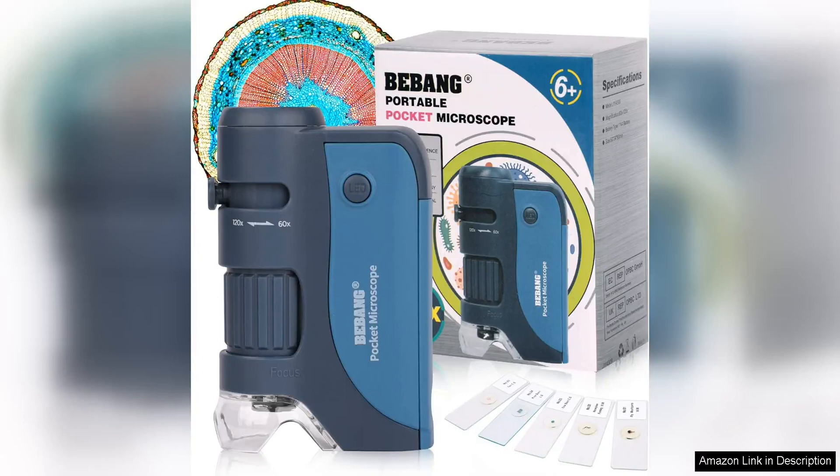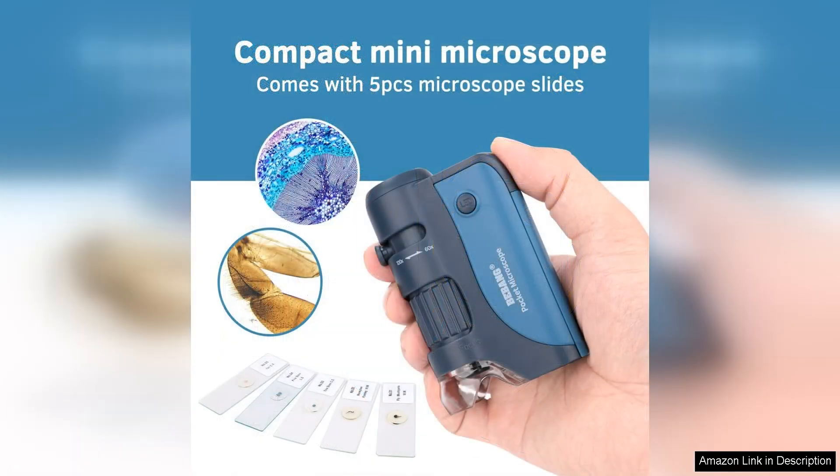The Pocket Microscope is a handy tool for curious kids and adults alike. With magnification levels of 60x and 120x and built-in LED lights, this handheld mini microscope offers a clear and detailed view of small objects. Some included slides allow for immediate exploration, making it a great educational tool for budding scientists.